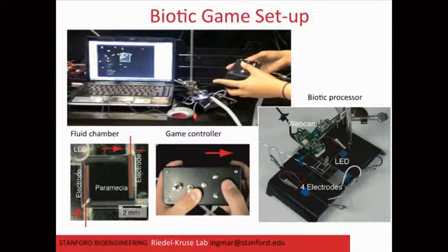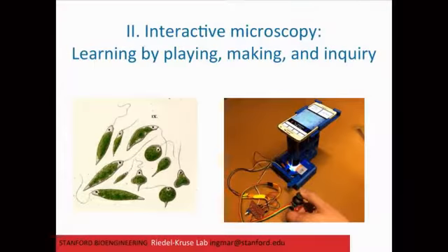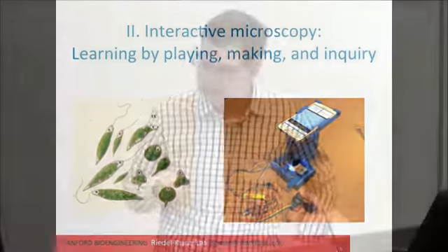So here you see again the setup. It's very simple, right? This open chip, a hacked webcam, and then you basically project this on a screen. So this was our very early first thing that we built and it laid the paradigm of what a game could be like on that sort of platform. And since then, we've gone quite a bit further down the road.